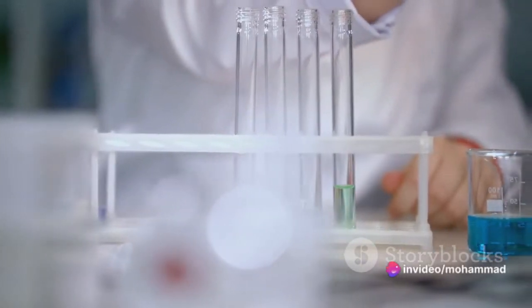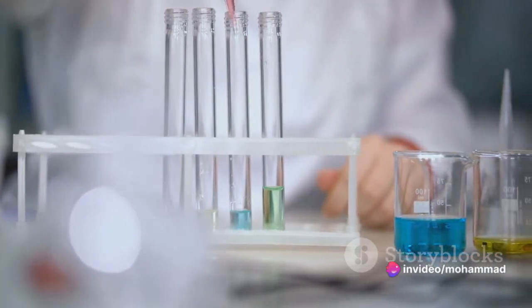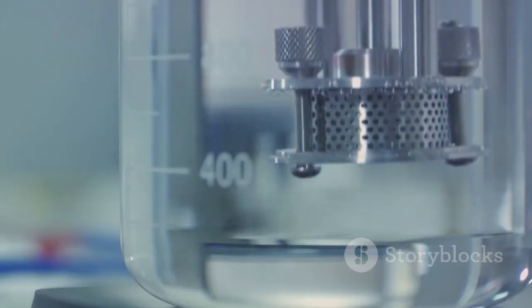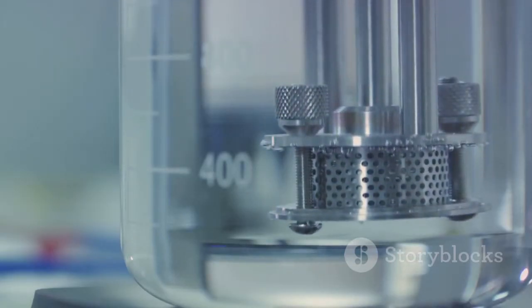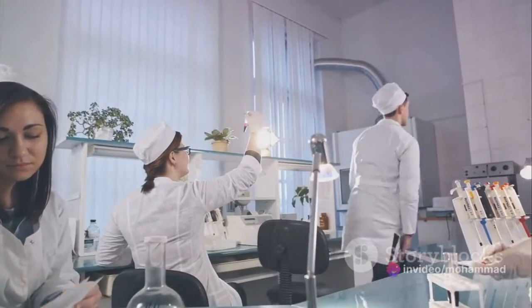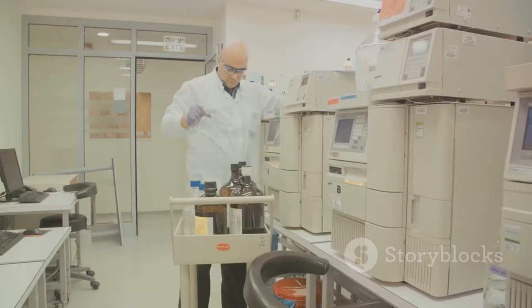Next up is the injector. Think of this as the starting point of our race. It's here that the sample is introduced and vaporized, ready to compete in the race. Then comes the column. This acts as the racetrack. It's a long coiled tube where the real action happens. The molecules race along this track, separating based on their different properties. Some are quick, some are slow, but each finds its own pace.